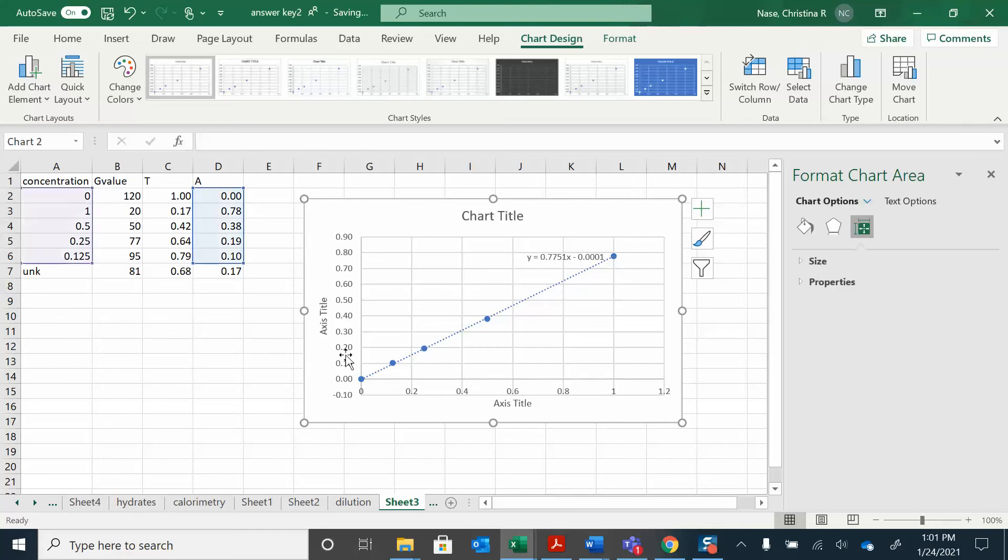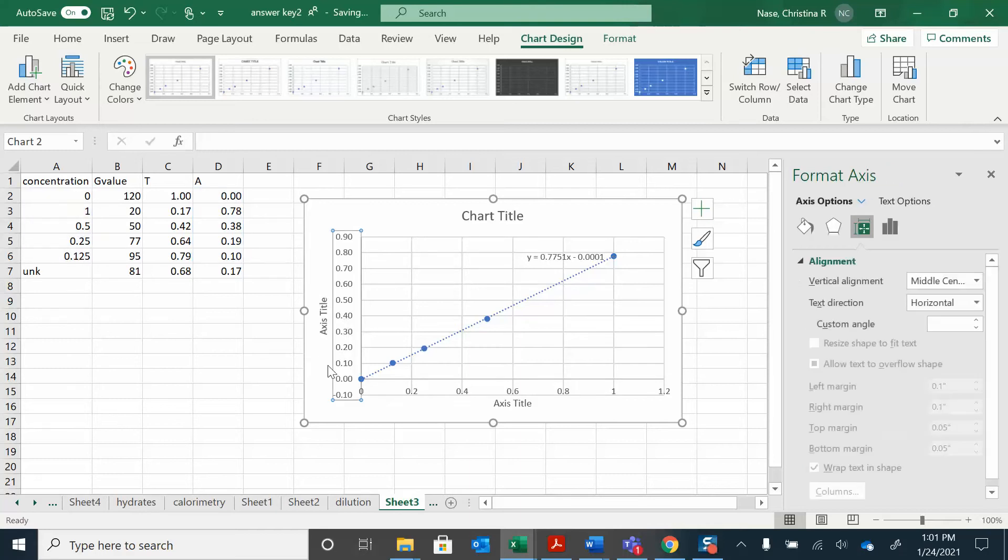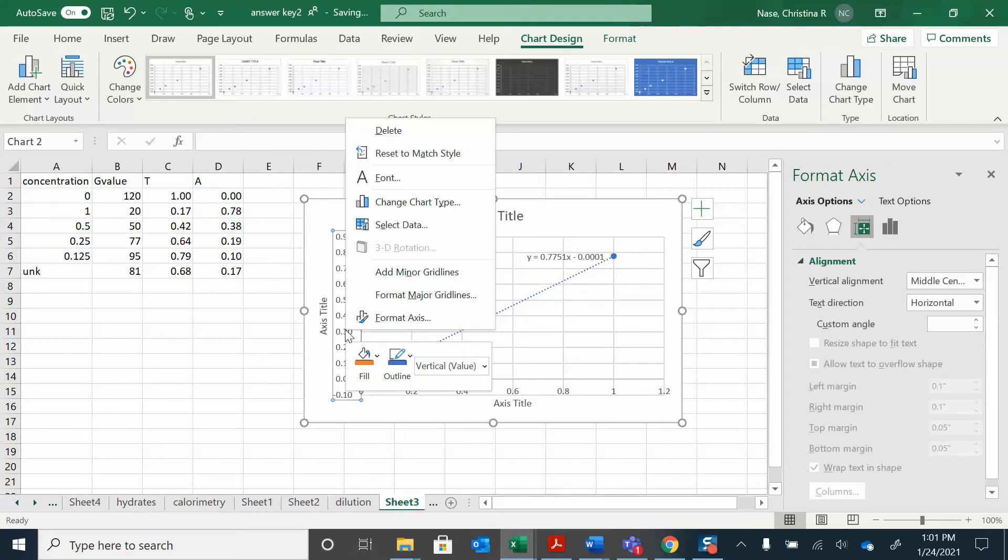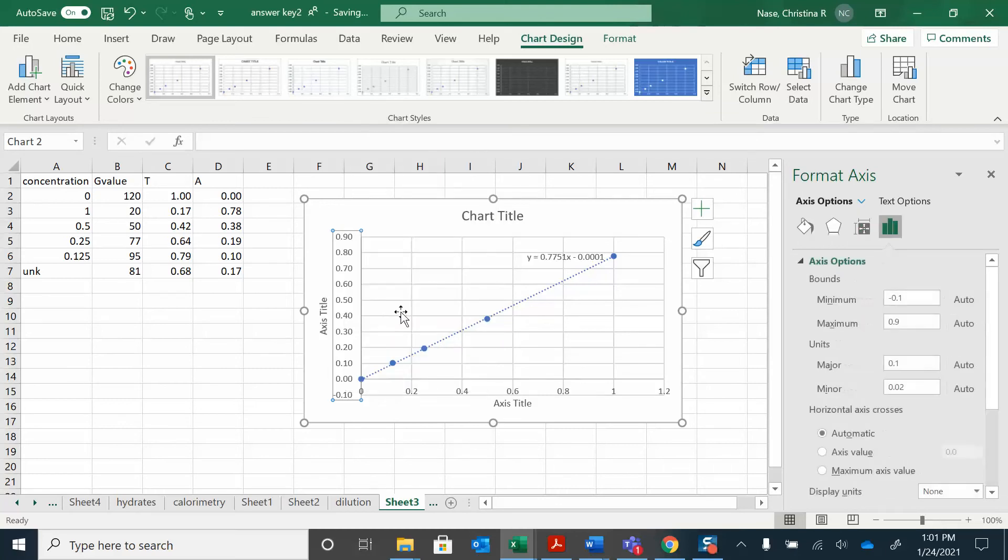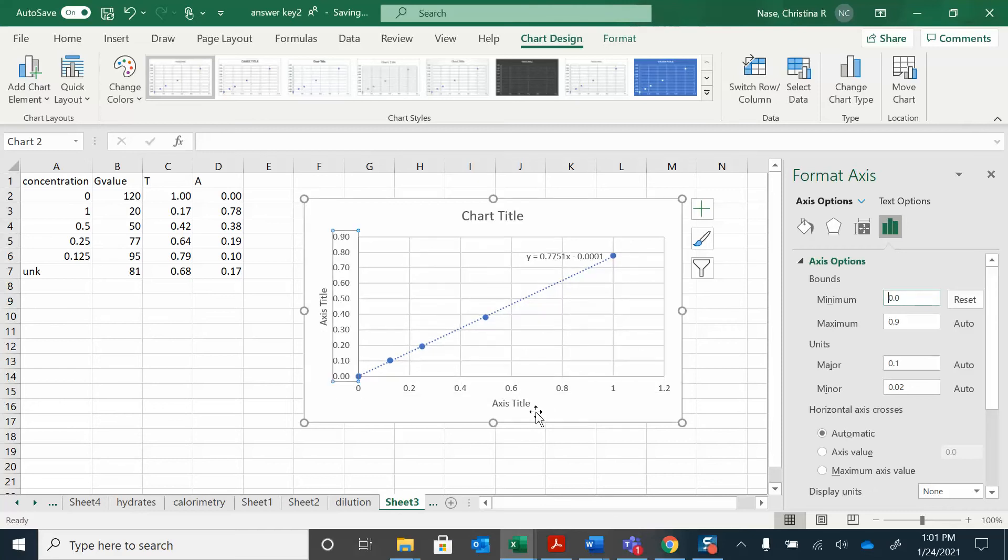When I did that I got that negative sign there. I want to change this format axis. Format the axis. I want to set that back over to 0. Okay. Now I have my trendline.